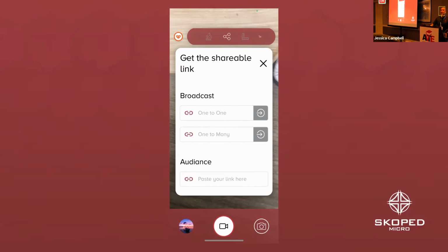There's not just Kate out there doing it. She doesn't even own a microscope anymore. You can only send her pictures and videos, but that's going to become a good thing. Now that means we've got to make good slides. That means we've got to know what we're doing. So that's where you guys come in, helping me have good technicians.